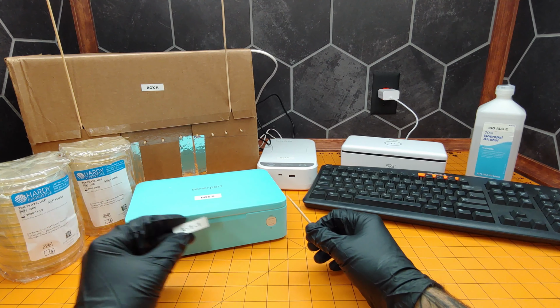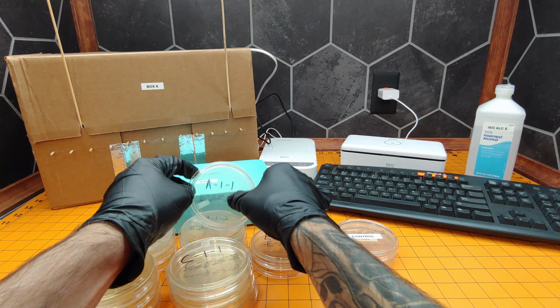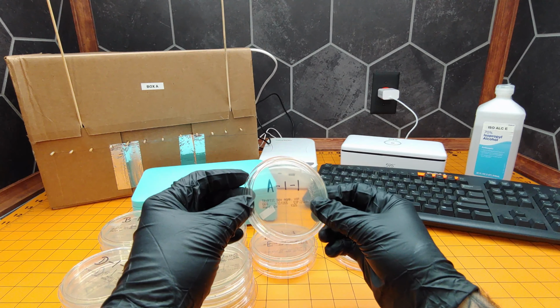So, first thing we need to do is open up these plates and label them all. Now that all of our petri dishes have been labeled, the labels are on the bottom of the dish so that if we were to lose the lid, the label stays with the bacterial cultures. So what I'm going to do is take all except the controls, which are going to stay over there, and move D, C, B, and E, and we're going to focus on box A first, which is our big box.